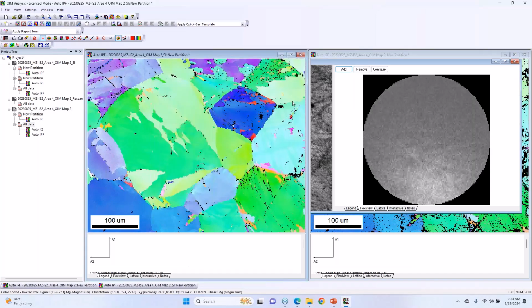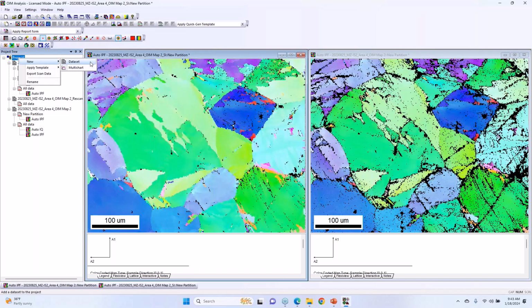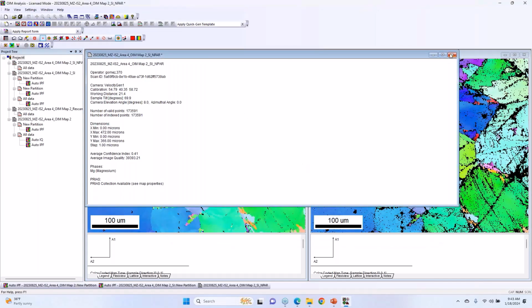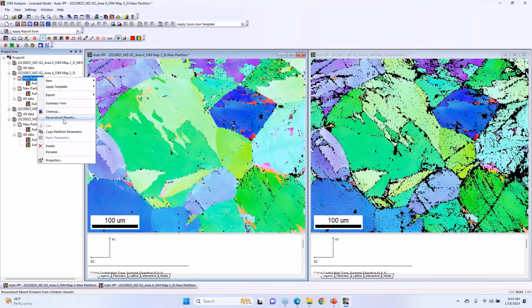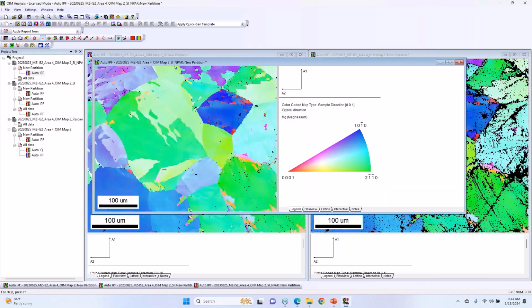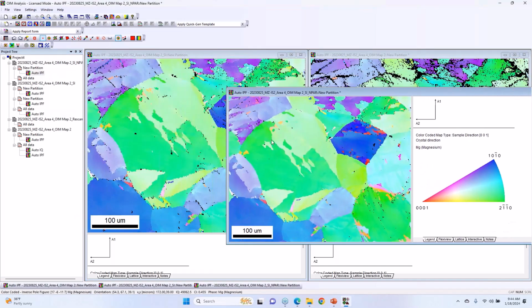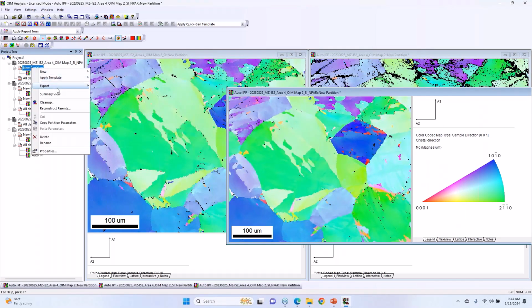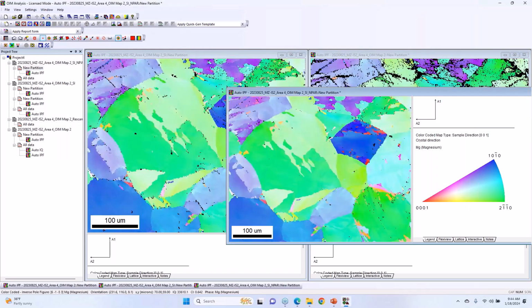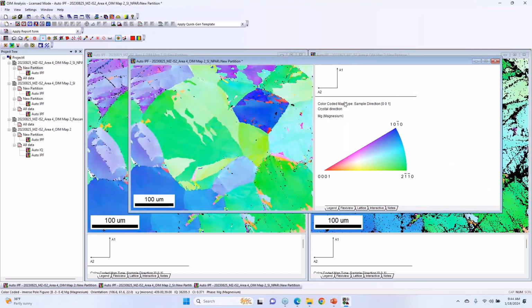So what we do with something like that is we can go ahead and run it with NPar, and we can copy this same partition and paste the partition and look at it. You can see NPar cleans that up a little bit more, where it jumps from there to about, again, 99.5%. So you can get some nice results from the magnesium.